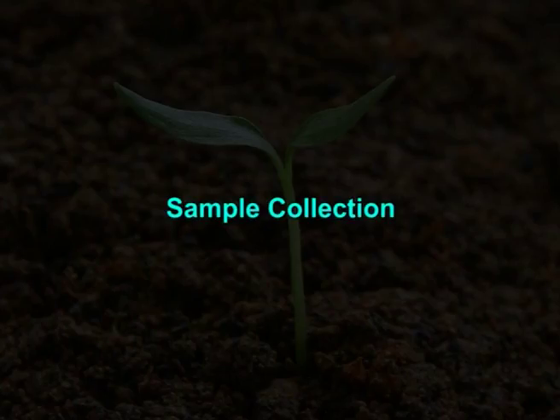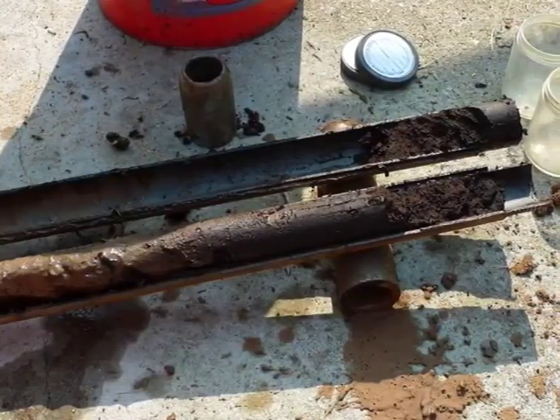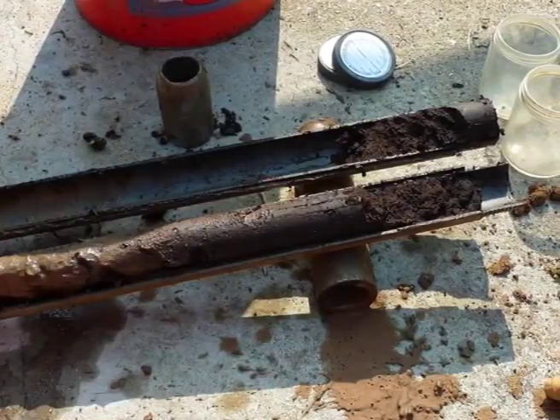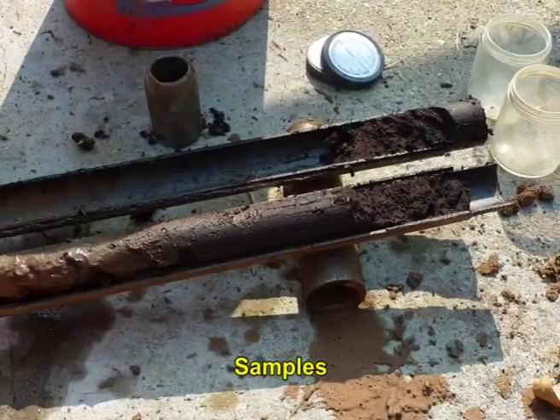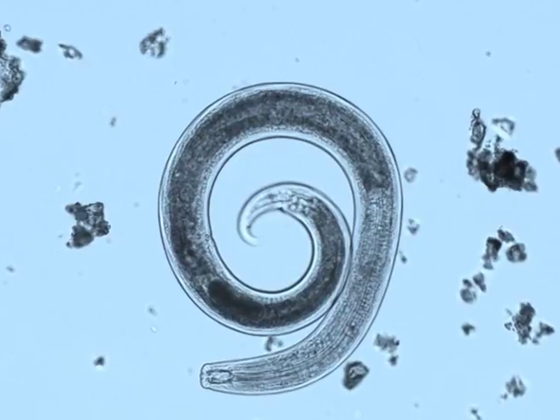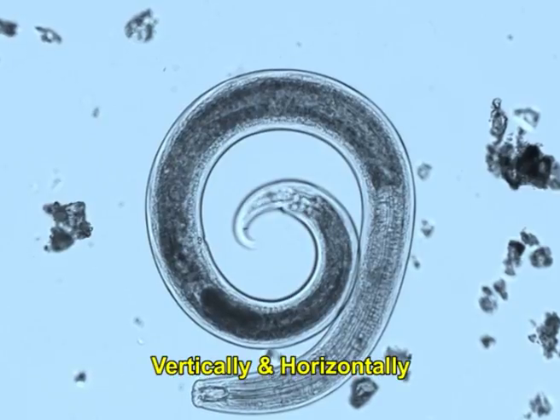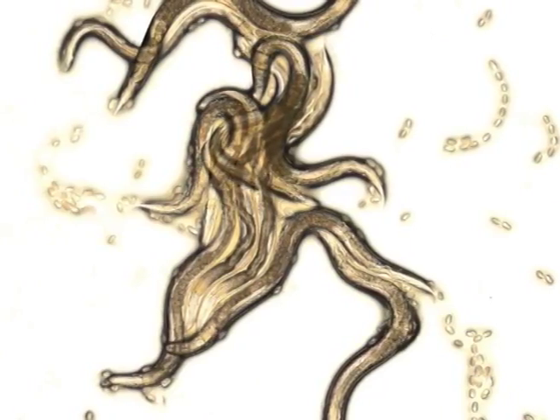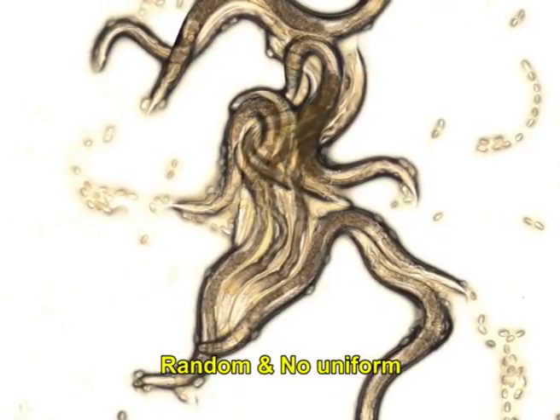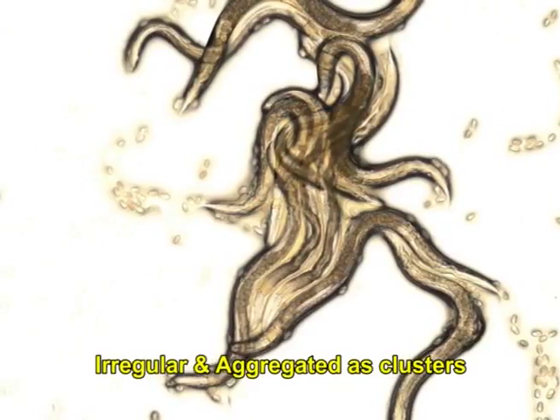Sample collection. Laboratory determination is a vital tool for assessing nematode problems. Nonetheless, an analysis can only be as good as the samples. Therefore, proper sampling procedures are critical. Nematodes are unequally distributed in the soil, both vertically and horizontally. The distribution of plant parasitic nematodes in the field is random and non-uniform. Their distribution in the field is irregular and aggregated as clusters.